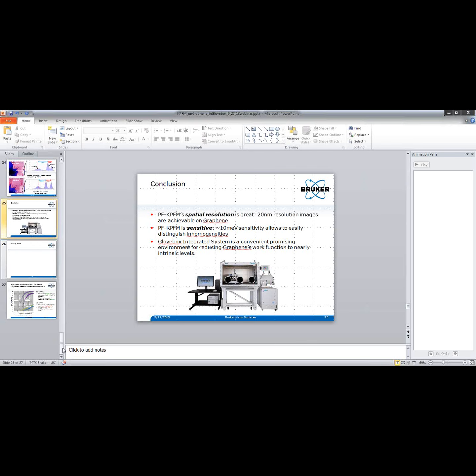Okay, and what tip did you specifically use? Yeah, the tip is called the PFQNE-AL. The AL is for aluminum.